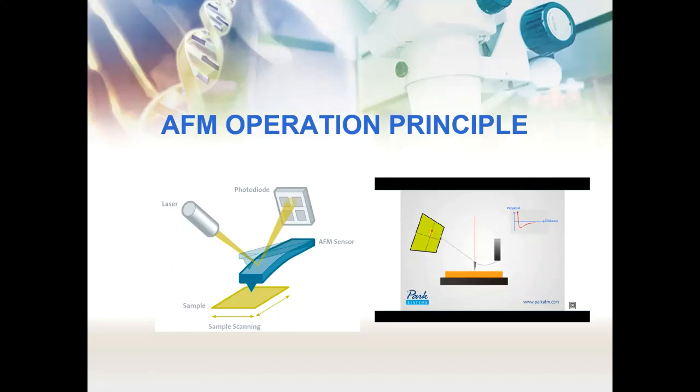The deflection is measured by a laser, which is reflected off the cantilever onto photodiodes. As one of the photodiodes collects more light, it creates an output signal that is processed and provides information about the vertical bending of the cantilever. This data is then sent to a scanner that controls the height of the probe as it moves across the surface. The variance in height applied by the scanner can then be used to produce a three-dimensional topographical representation.